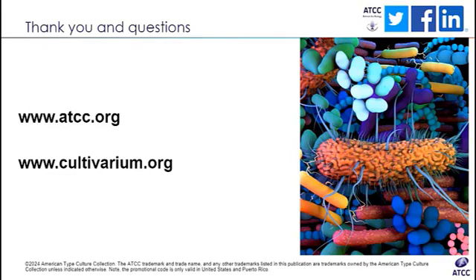What are the plans for the methylation pattern side of things? Are you incorporating that into your tests with the POSSUM toolkit? Yes, we have a bioRxiv preprint about identifying the methylation patterns, that is the Microbe Mode, and I really recommend everyone to look it up. The main thing is that we use it to help avoid the restriction modification systems. And we have a plan to develop these tools to avoid it.